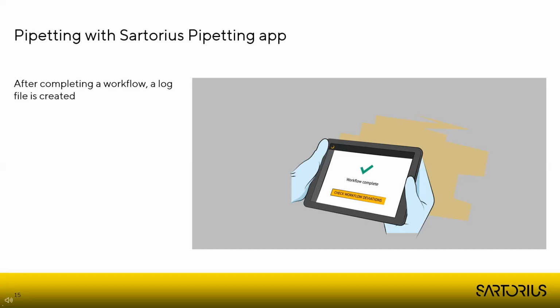All the reports, they are saved in the database for later access, or if you prefer, you can have a PDF copy saved wherever you need. So for example, if you have a system in your lab already in use, you can save those notes in the same system as a PDF, which is pretty handy.